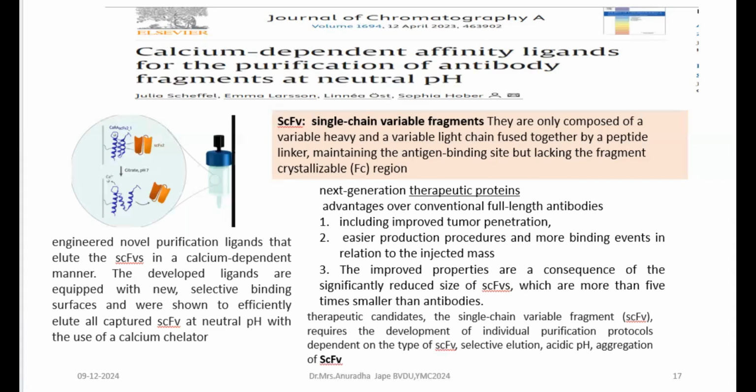Antibodies are coated onto the support matrix, and as the antigen mixture flows down, the antigen will get selectively bound to the pre-adsorbed antibody. But here, for example, monoclonal antibodies are used for purification. Here I'm not talking about the entire antibody, but about a fraction of the antibody. What is that fraction? If you see the diagram carefully, or the title, it is scFv, that is, single chain variable fragment. You have variable fragments and fixed fragments. Out of that, the single chain variable fragment is what needs to be purified. Why go with it?